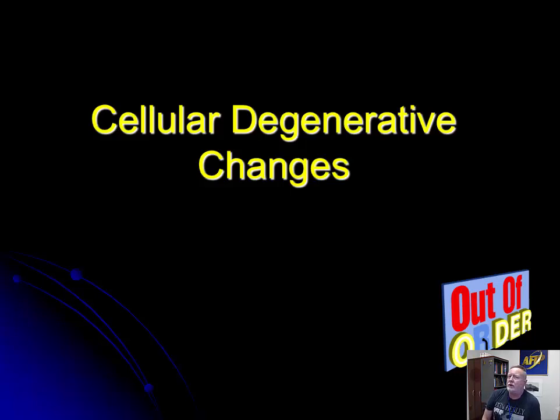Well, hello, it's Bruce Williams again, and today I want to present the second lecture in my series on ultrastructural pathology, in which we're going to talk about cellular degenerative changes.